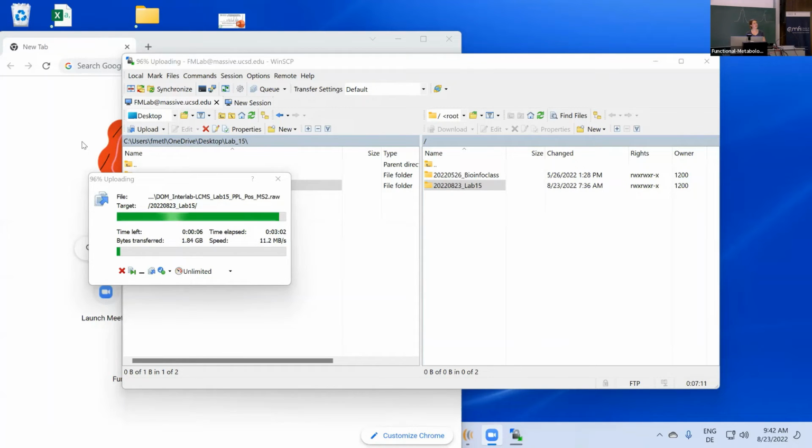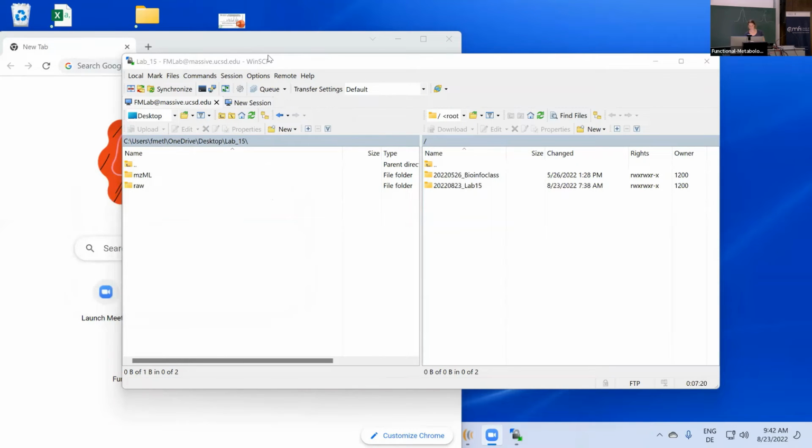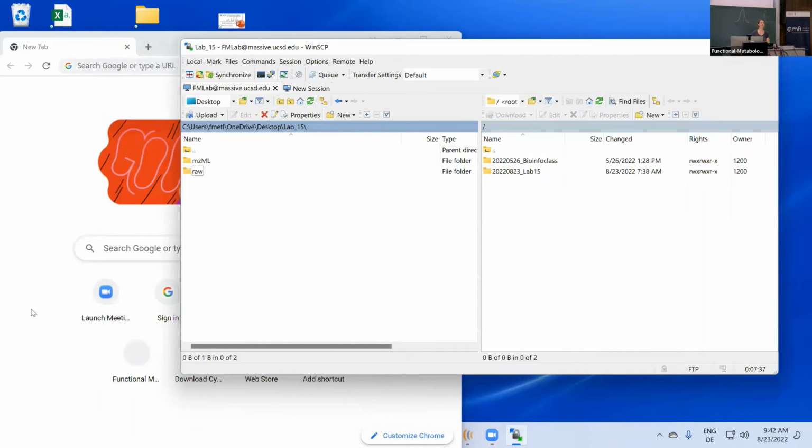Does anyone have any ideas about MS Convert on a Mac? I guess it's not supported. Maybe we'll get back to you on that. I will, whoever is watching and asks the question. Okay. Are there any other questions while we're at a pause point?